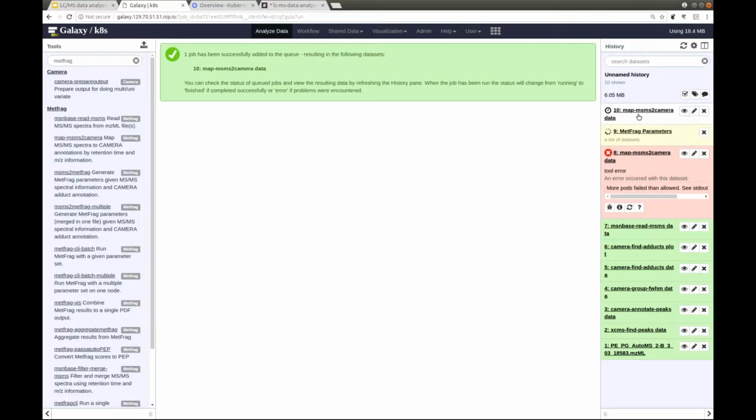And we'll see if the tool will then resume operation once all the required inputs are done. You also see that the history down here is linear, starting from 1 to 10 now, whereas the actual workflow that we have already seen before is more a graph structure, where the data is traveling through different branches.